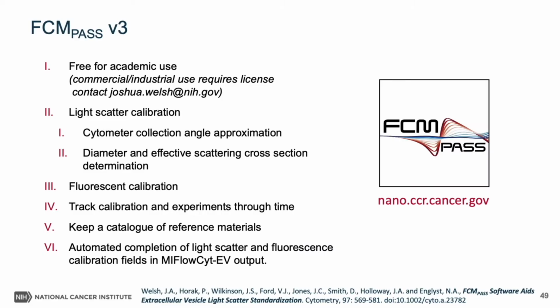I'm now going to show you the latest release of the FCMpass software. As well as performing light scatter calibration, this software allows you to perform fluorescence calibration and create automated MIFlowCyt-EV reports of your experiment with respect to the calibration and characterization fields.